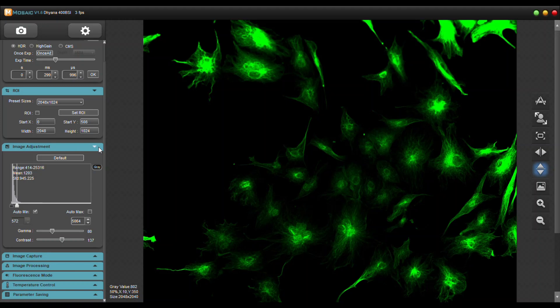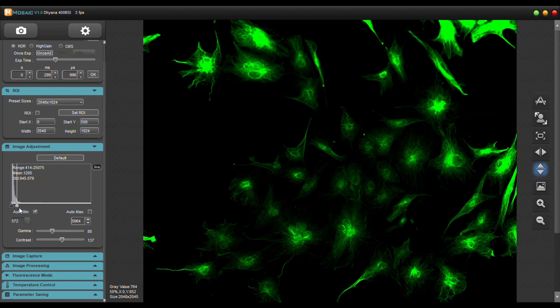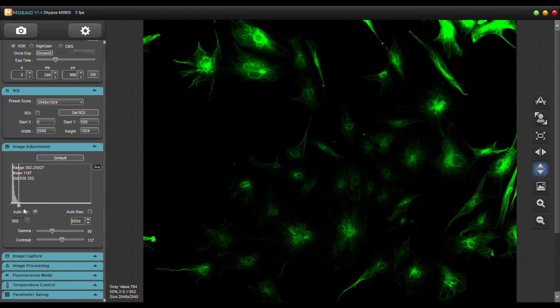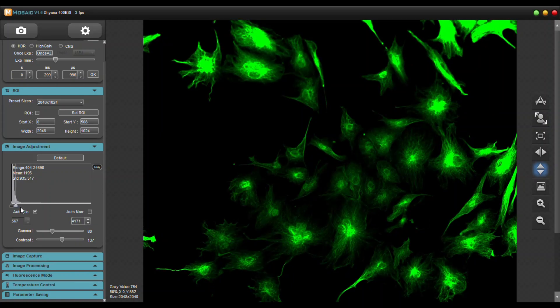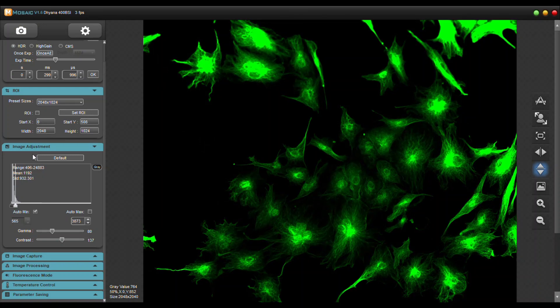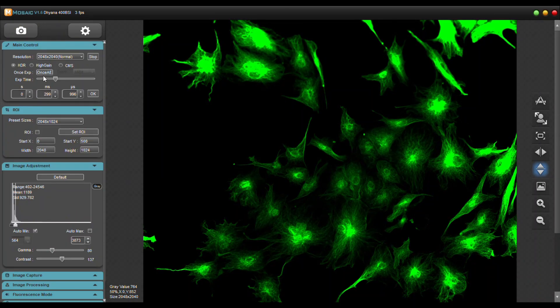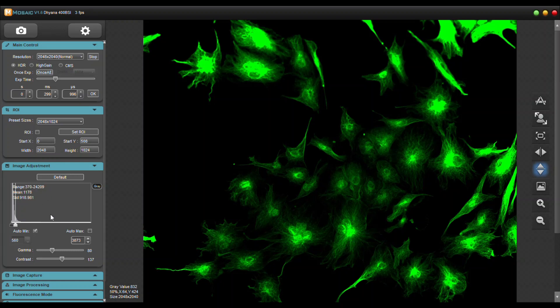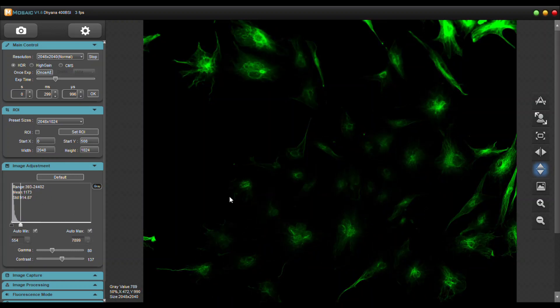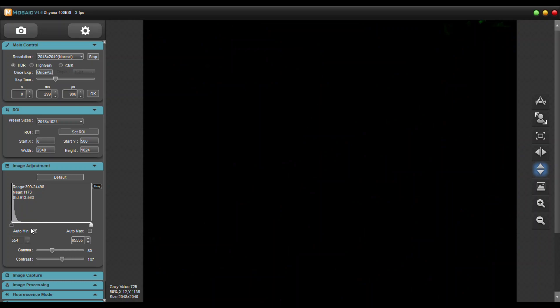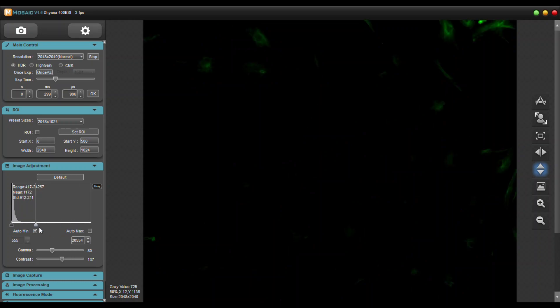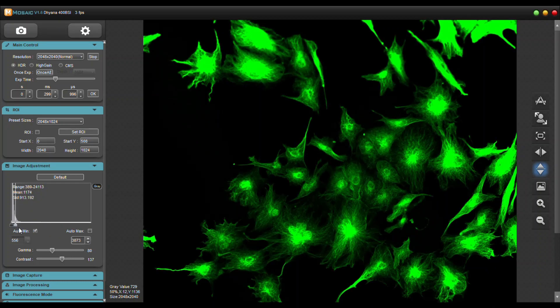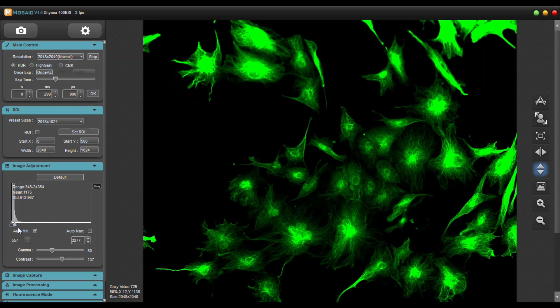This is a pretty great image and you can use these sliders to bump up the intensity of the image to make it brighter or darker. You can also hit AE and that will do an auto exposure with auto min max adjustment. I'll just bring this back down to make it a little bit brighter.